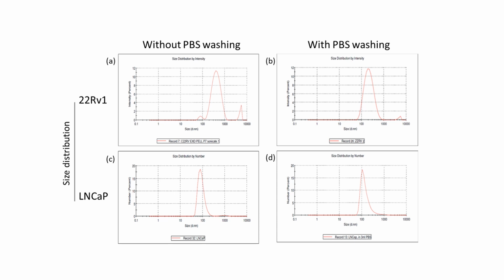The polymer chunks that hold the exosomes leave the DLS with false measurements that shifted the peak of the 22RV1 size distribution to the right, which means bigger size. Post-purification, the 22RV1 size distribution peak had shifted back to the left, indicating exosome release from the polymer captivity, though in this case, exosomes from LNCaP cells did not show any difference.